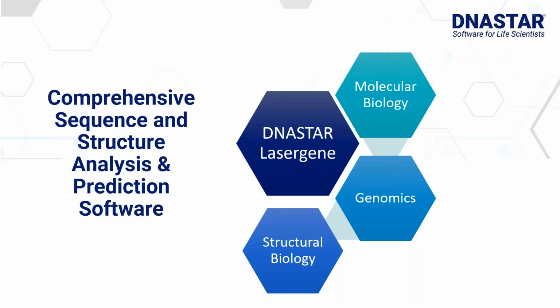So just a quick overview of DNASTAR Lasergene in case anyone here is not familiar. I know we have some new users with us today. DNASTAR Lasergene is a comprehensive software suite, and so it consists of applications for molecular biology and sequence analysis, next generation and now long read sequencing, assembly and analysis, as well as structural biology and protein analysis.